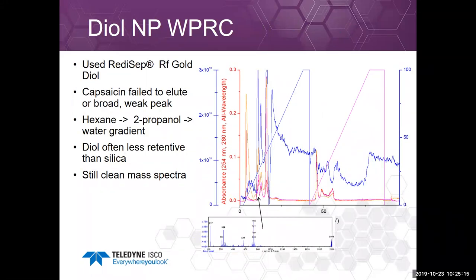Next I ran wide polarity range on the diol column using the hexane/2-propanol/water gradient. Diol is often less retentive than silica, so something that might stick on silica might come off a diol column. Also, for very nonpolar compounds, you might actually get better retention on diol compared to silica because a very nonpolar compound might not adsorb strongly onto very polar silica, but diol is somewhat less polar. We still see clean mass spectra, but the active compound still isn't showing up.